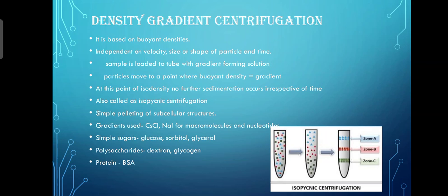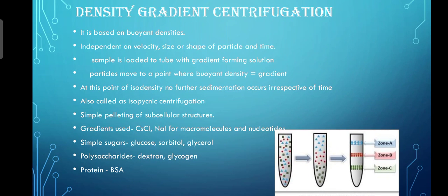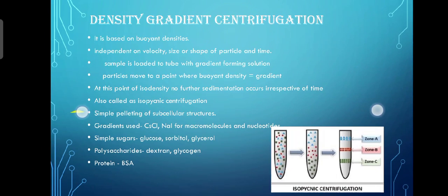own density. In isopycnic centrifugation, separation of particles occurs into zones on the basis of their density differences. It is independent of time.